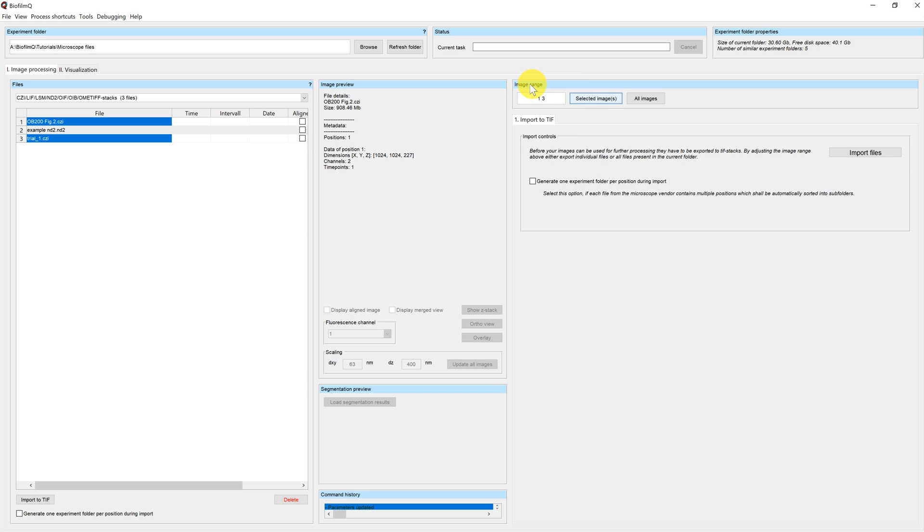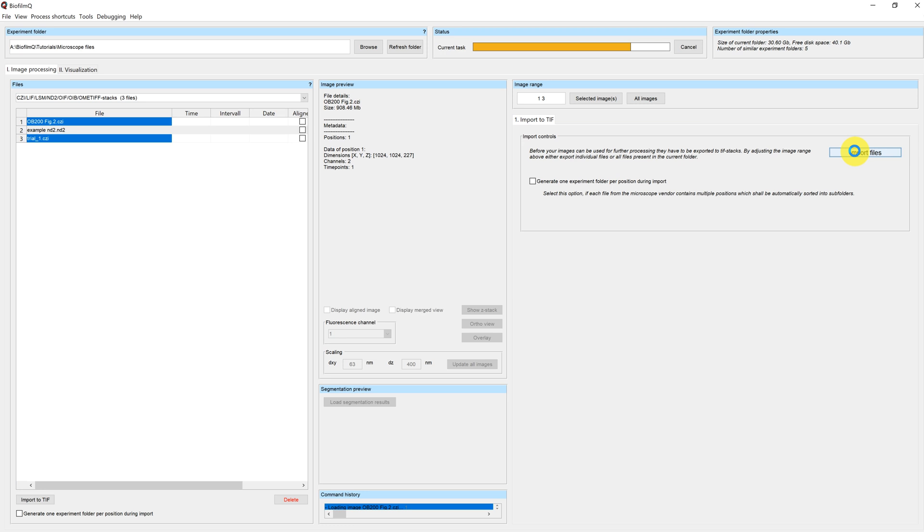And again click on selected images to import them both at once. You can see here the image range has changed to 1 space 3. And actually we could type that ourselves if we hadn't selected the images first. We again click on import files and wait for the import to finish.